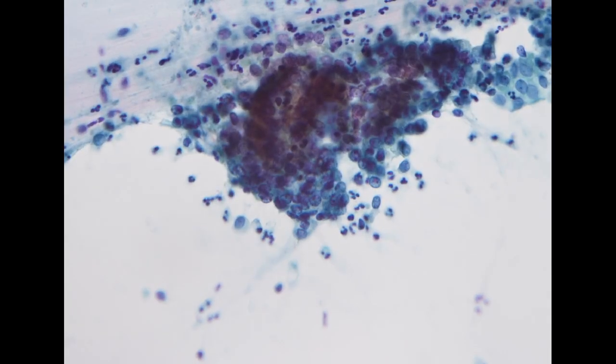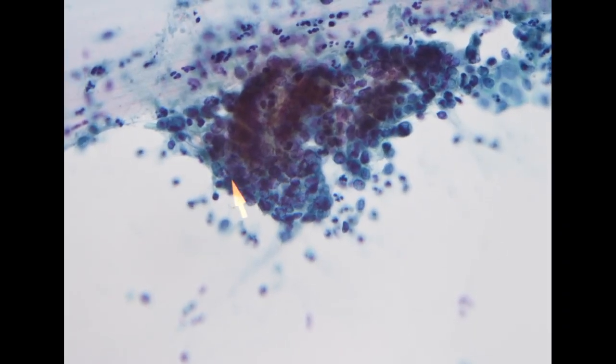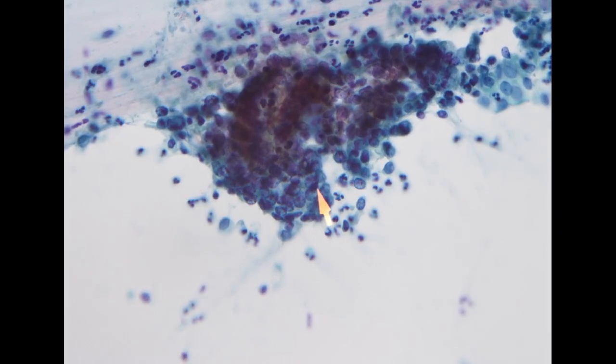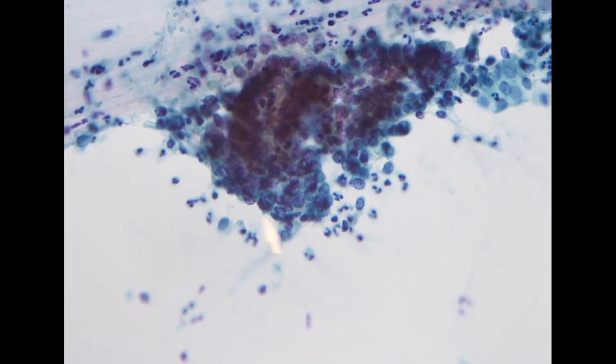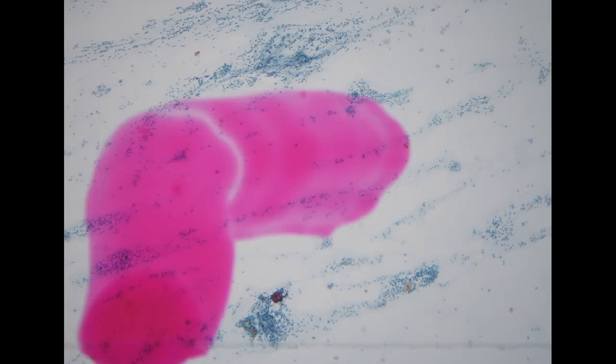And this one also, it's very tight, and the small high NC ratio feature is compatible with a cluster of stromal cells, not glandular cells. So for this specimen, we cannot call it atypical glandular cell because we didn't see any. What we only see is the stromal component as well as the debris.